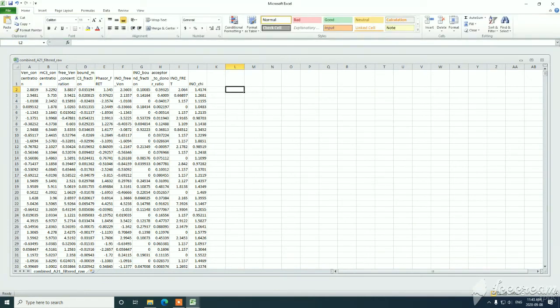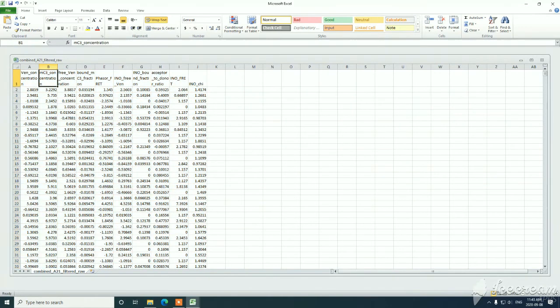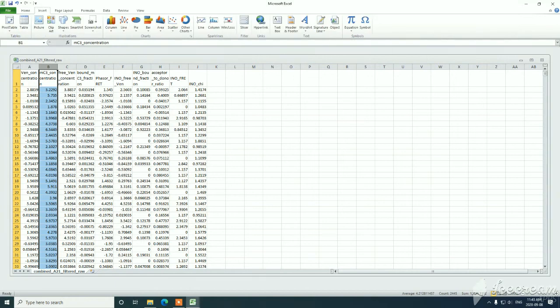The last thing you can do at this point is decide on your filter for mCerulean 3 concentration. So we've exported the total data from 0.5 to 8 micromolar cerulean 3 expressed in each ROI, but we require the designation of a narrow range before doing binning in the next stage. Our default is to filter between 1 and 3 micromolar, but depending on your cell line, you may have a different range of expression.